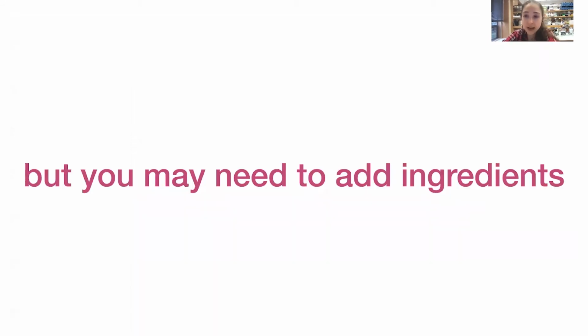But anyway, so that's the minimal media. That's one example of a minimal media. M9 is just minimum salts and stuff, but that doesn't mean that there aren't other things that these bacteria need. And so you often add other ingredients, and you can add ingredients to test their importance or to test the ability of bacteria to survive with or without them. This can help you test for the importance of these things or the ability of the bacteria to grow without them.